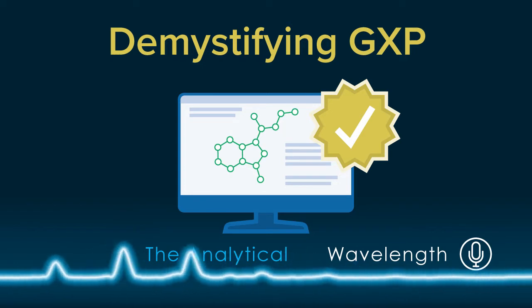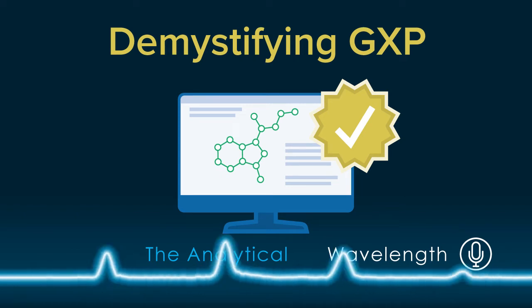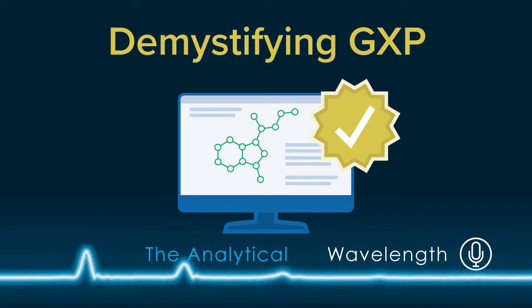In today's episode, we wanted to demystify the regulations surrounding data and chemistry software. For those of you who don't already know, GLP and GMP stand for Good Laboratory Practice and Good Manufacturing Practice, respectively. These topics are often grouped alongside those from other industries under the acronym GXP.